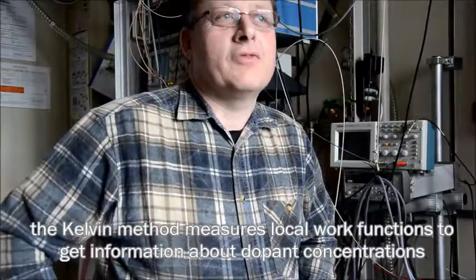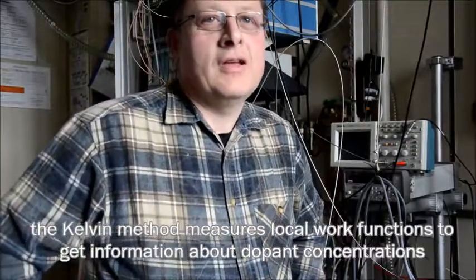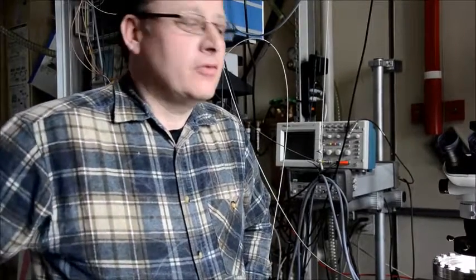That's something where we can get information about this dopant concentration. So this is quite a practical thing, not so much about the high resolution, but more about the dopant concentration, so something to get quantitative information.